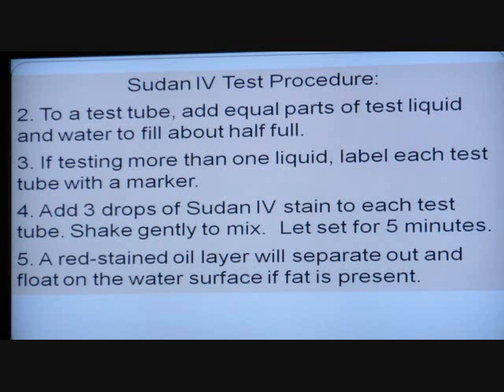They work the same way according to what Michelle told me. But there is one where you can add alcohol — I want to try that because I understand adding alcohol to the product does something to the fats to make them more available. You've also got to let it stand so the precipitate doesn't form too fast.